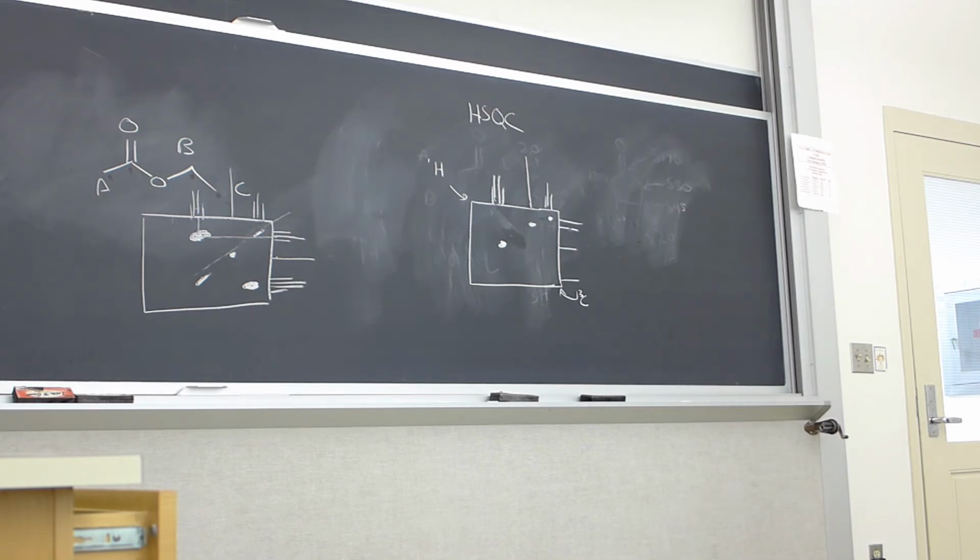Rachel? Is it just another button that we press? It's just another button. You hit HSQC, and then the data appears, after a period of time. That's HSQC. Super useful. Super useful.